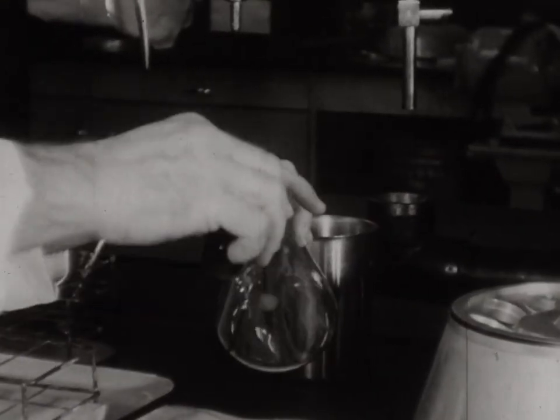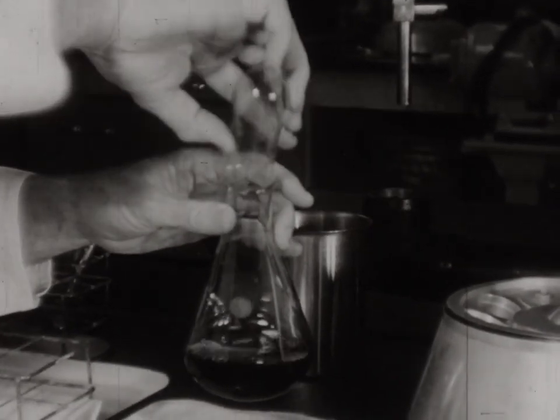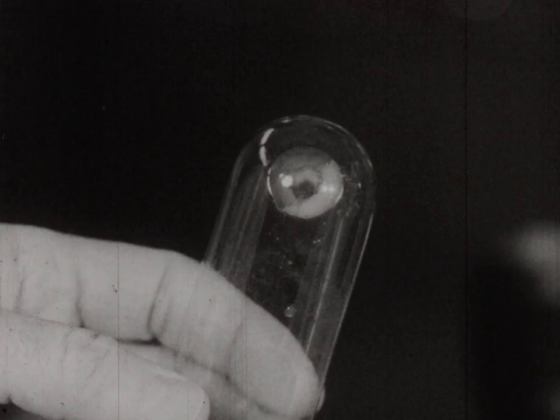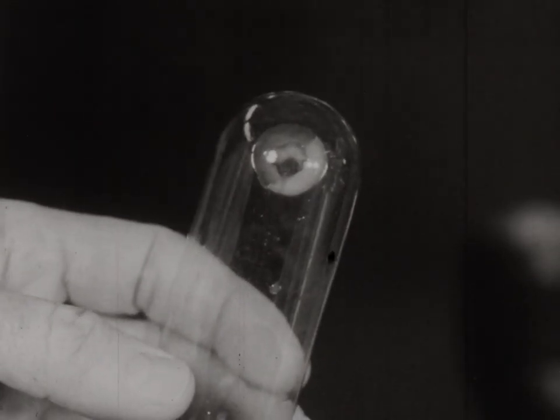We're then able to pour off the juice, and after we have poured off the juice, we find that there is left in the bottom of the tube a pellet. And this pellet contains viruses in quite purified form.